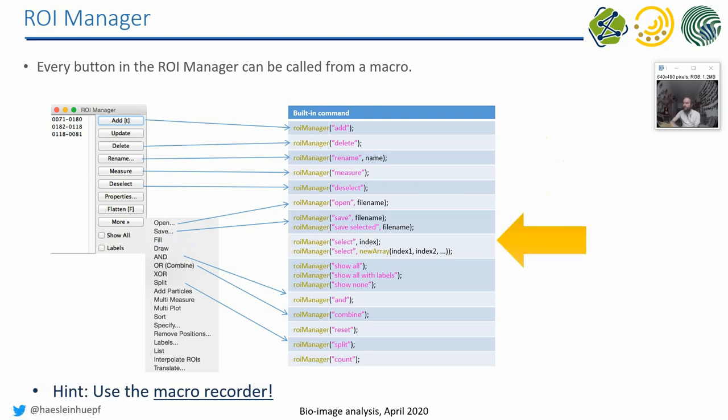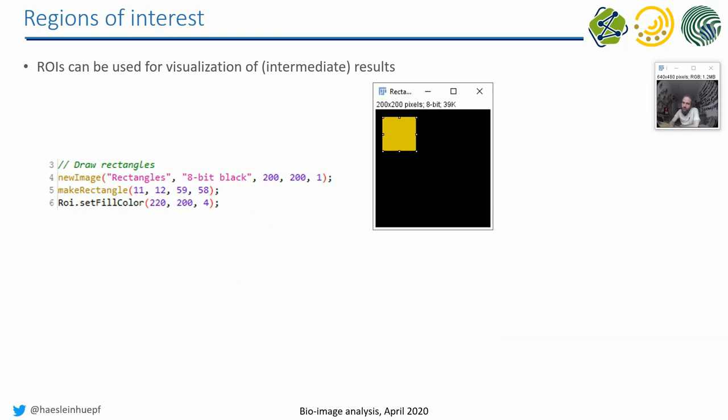For example, later on in an exercise potentially, if you want to visualize a particular ROI from the ROI manager, you use this select method in order to click in this list. So if I would click here, the recorder would record that I clicked on item number two. Because the first one is number zero, the second one is number one, and the third one is number two.